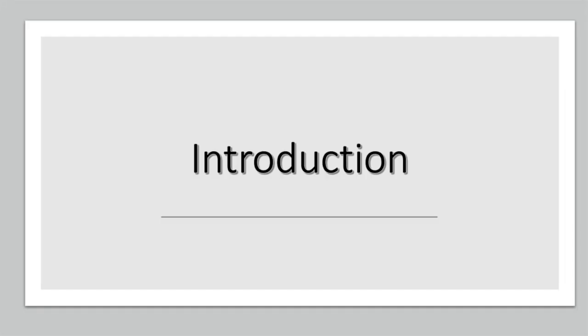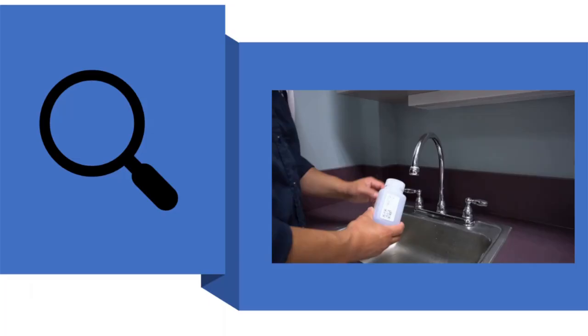At this point, your school should have collected your initial lead samples and shared the results with parents, students, and staff. Based on those results, your school may decide to pursue remediation or mitigation efforts to reduce the lead currently present in your drinking water. All remediation and mitigation efforts are voluntary. However, training material is available to assist your school. As always, samples collected as part of this program are available at no cost to you.